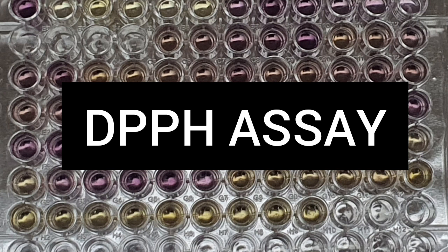But before going toward the protocol, let's first have a look at some relevant concepts. Antioxidant activity deals with the kinetic of a reaction between an antioxidant and the pro-oxidant or the radical it reduces or scavenges.